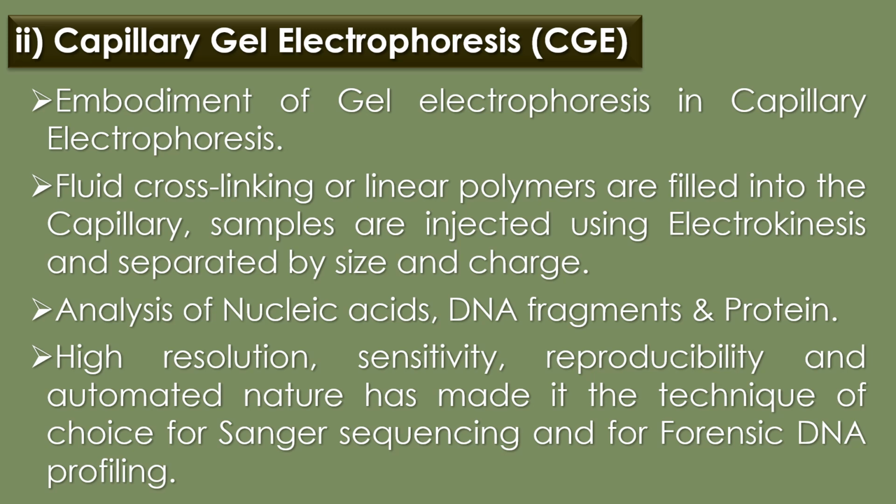Capillary gel electrophoresis has been applied to the analysis of nucleic acids, DNA fragments and proteins. The high resolution, sensitivity, reproducibility and automated nature of capillary gel electrophoresis has made it the technique of choice for Sanger's sequencing and for forensic DNA profiling.